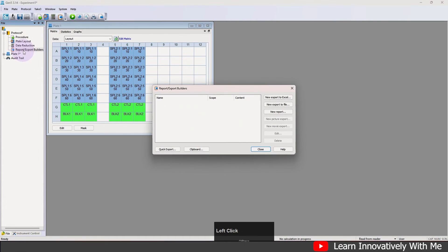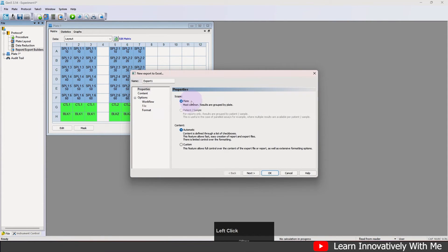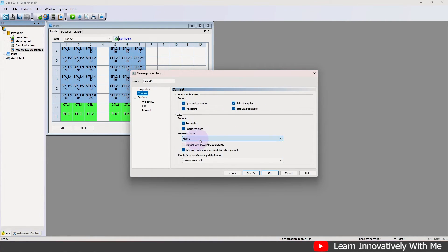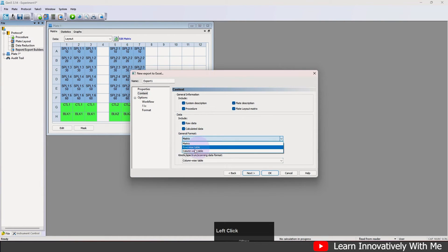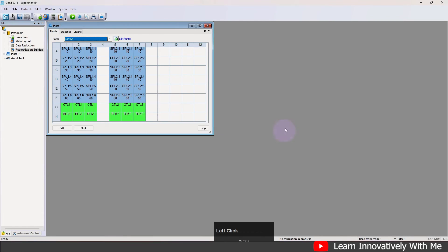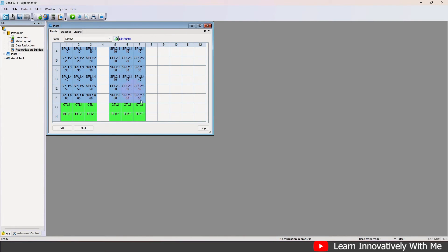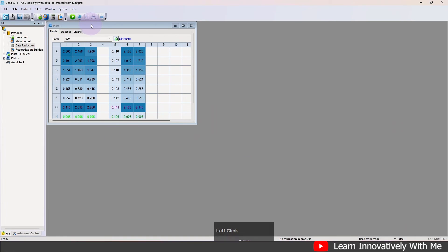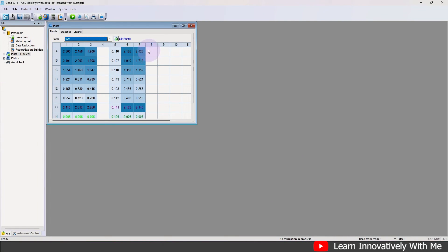The next thing is the report and export builder. You can prepare a report by clicking 'New Report' and selecting what you want: system description, procedure, raw data, calculated data, matrix, and general format options such as matrix row-wise or column-wise. Click OK. After taking the absorbance, you will get all your data in the report.